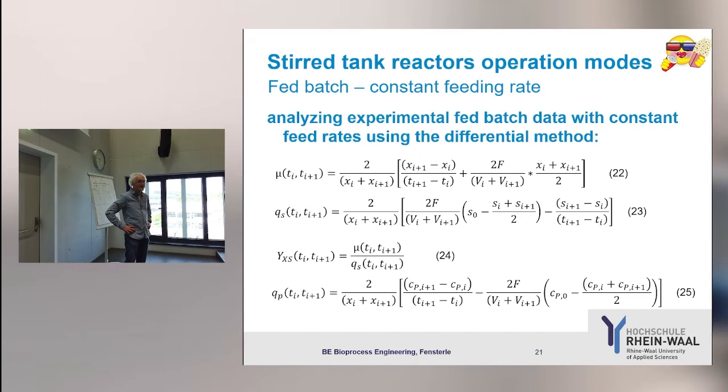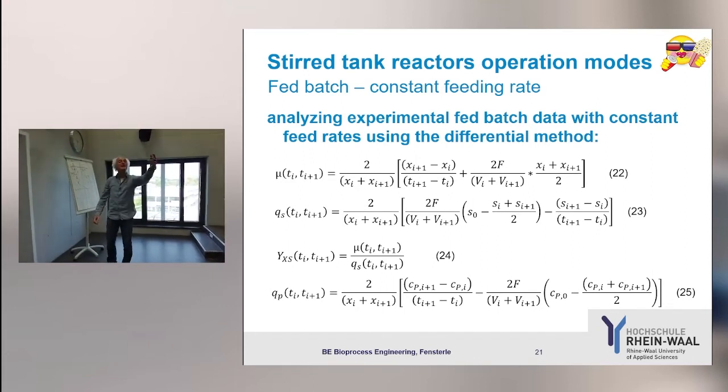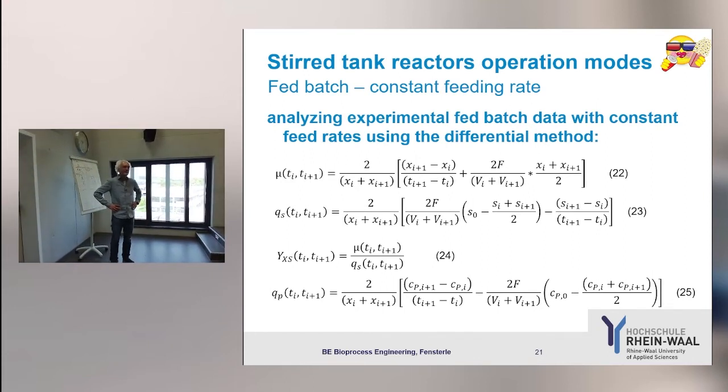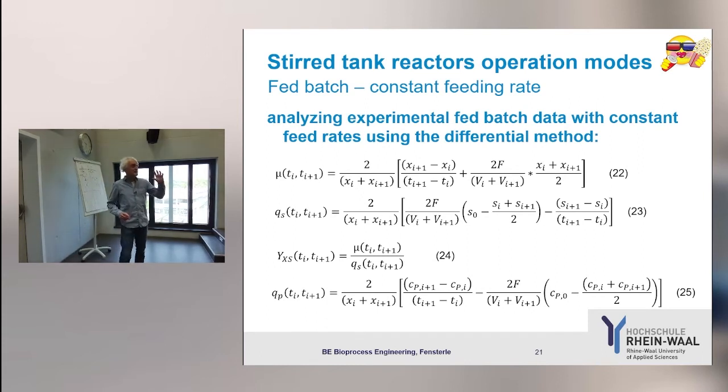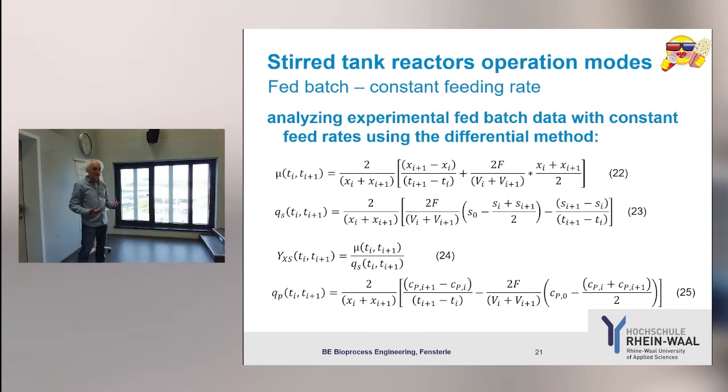But also our reactor. Yeah, Ramona. Not volume, we take a lot of samples, like the entire reactor. So maybe you can repeat it. Yeah, okay. The reactor does not have infinite volume, so if we take a lot of samples, we eventually take the entire reactor. That's an important point. If you take a sample, of course, the volume of your reactor will go down. So you interfere with your process.